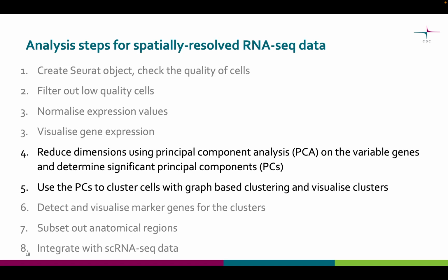The dimensions have to be reduced because the gene expression values of each gene measured can be thought of as the dimensions of the data. As we can have thousands of genes, we would also have thousands of dimensions. This would make the clustering complex and visualization of the clusters impossible. But often the gene expressions have correlations, and with dimension reduction we can remove these redundancies in the data. This way we can have a lower number of dimensions but still have the most relevant information of the original data.